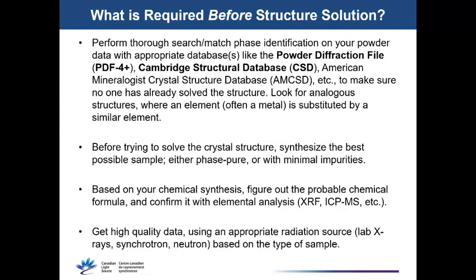So there's a few things you want to try to do before solving a crystal structure. First, you want to carefully look in the literature and see if somebody else has already solved your problem for you. And you'd be surprised how often this happens. You think you can't find a structure for something, but somebody out there has actually done it already.